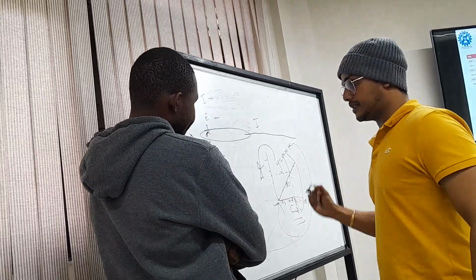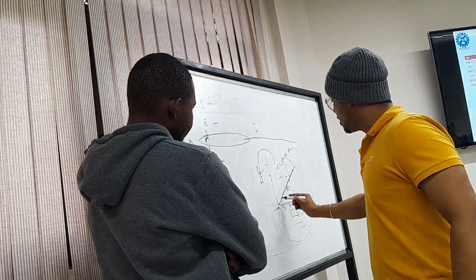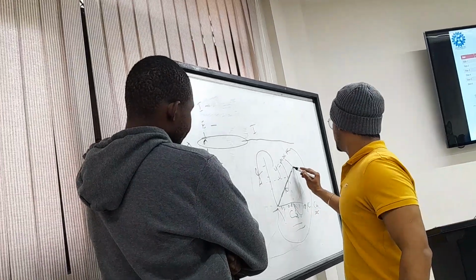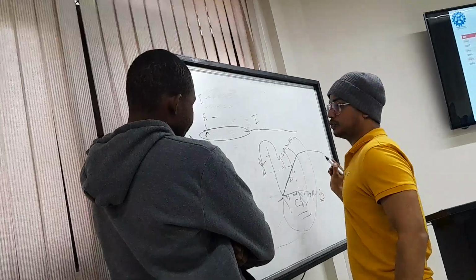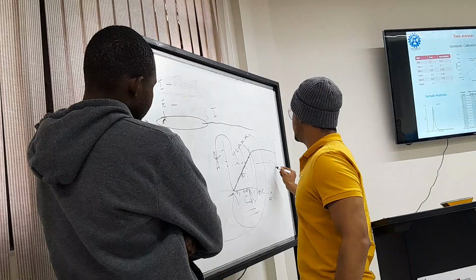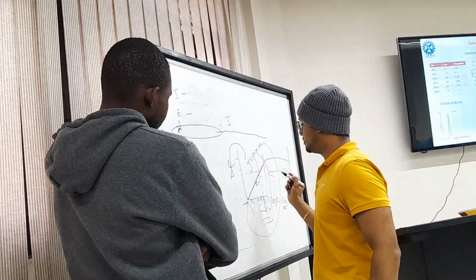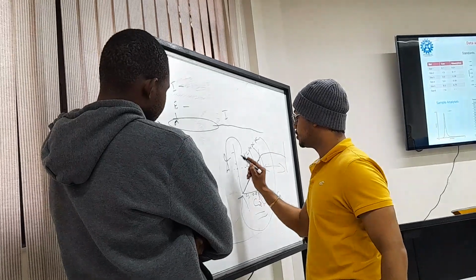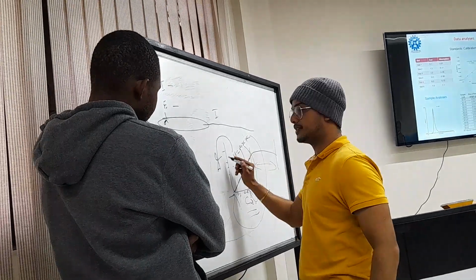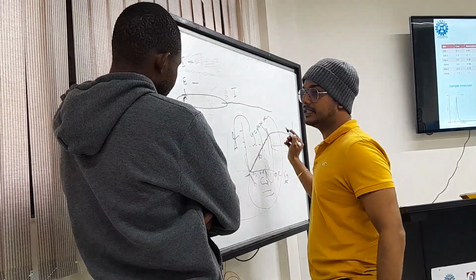Each element that can be analyzed with AAS has its own linear range, because at some point you start to get a plateau. This is the non-linear range, meaning Beer-Lambert's law is no longer applied, which is the direct relationship between absorbance and concentration. So you have to calibrate within the linear range.